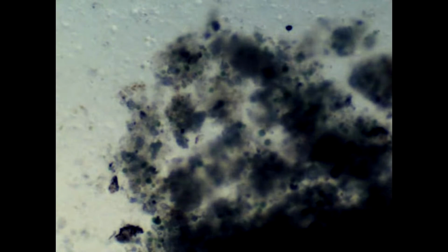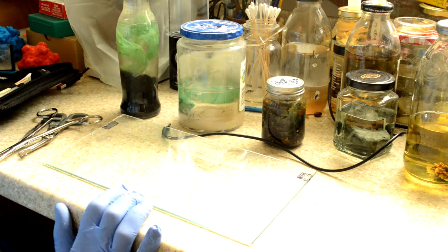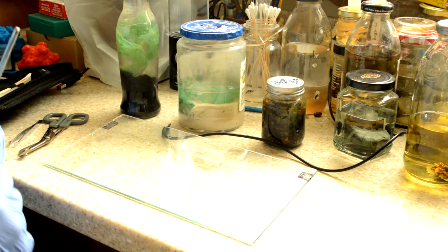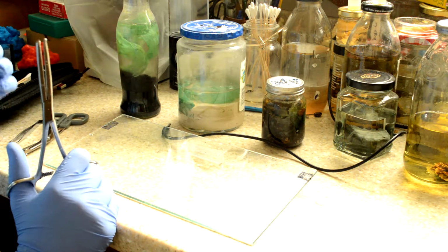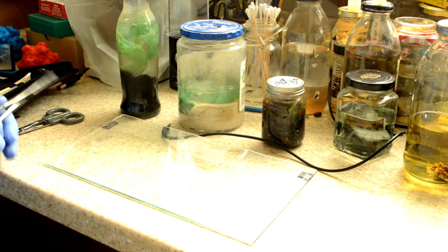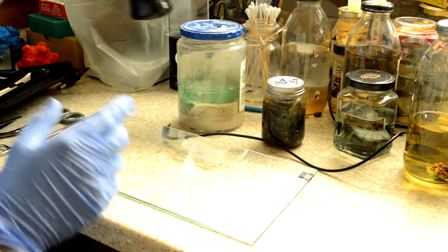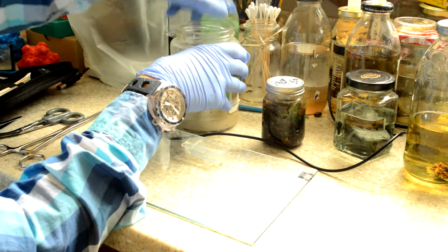Next we're going to be moving into the salt water, and we're going to see how that has been doing. Probably the most important thing you can do is make sure to wash off your cleaning table and your utensils very well. If you have isopropyl alcohol, use that. Make sure to rinse it off each time so you don't get any contamination in your tests. So next we're going into the saltwater sample. The freshwater was actually quite interesting, as we discussed under the microscope. Let's go into the salt water now.